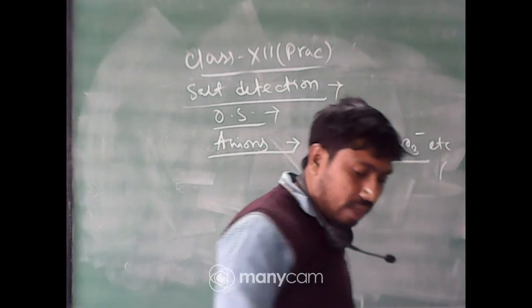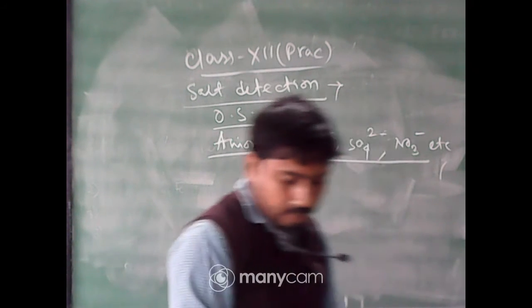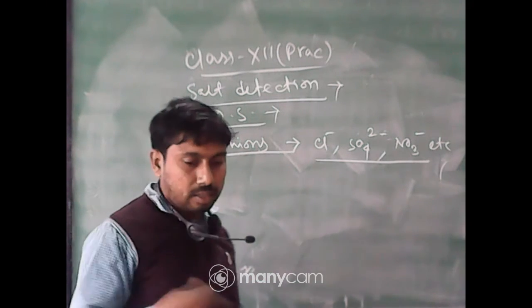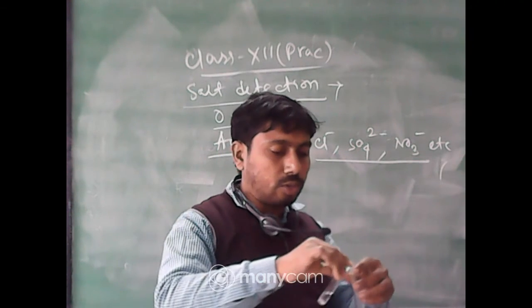Next, moving to the test for cations. For cations, again the original sample will be taken, and next the group reagents.